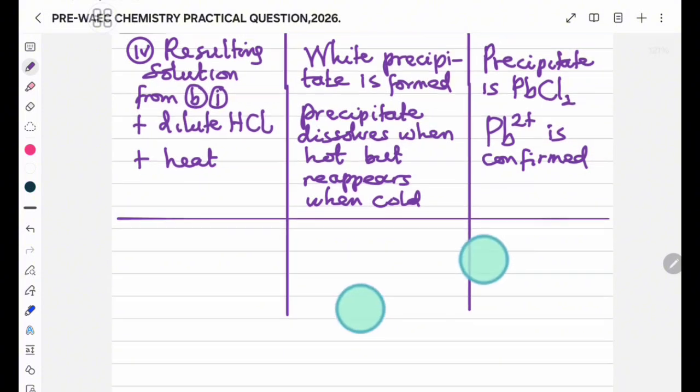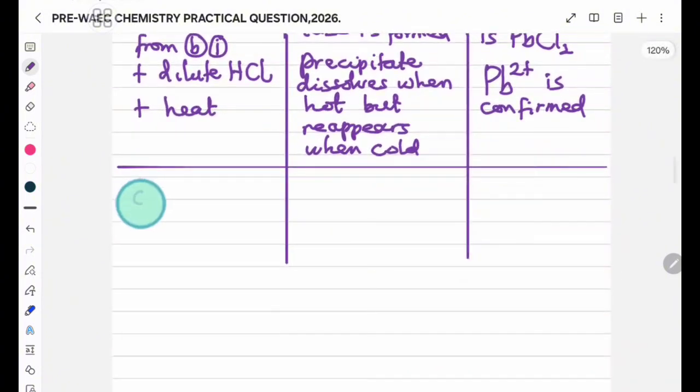The next test is the filtrate test. We are done with the residue test. Now the filtrate. The filtrate is just one single test using iodine solution. Don't forget, by reagents, a student should be able to predict what ions you are likely testing for, or what substance you are likely detecting.